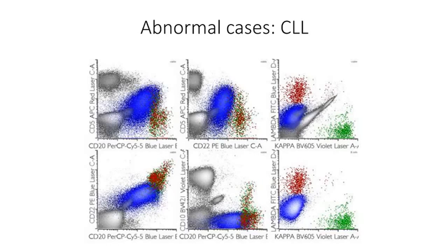Here we see 20 and 22 are both weaker compared with the normal. CD10 is clearly negative. So that switch to BV421 helps us here because we might have had a little bit noisier signal at the low end and equivocated on whether there might be some weak CD10. So that seems to be an improvement. And again, weak monotypic lambda light chain expression. Next case.